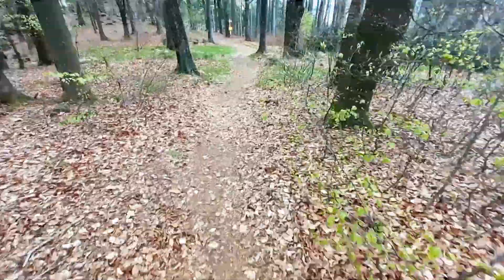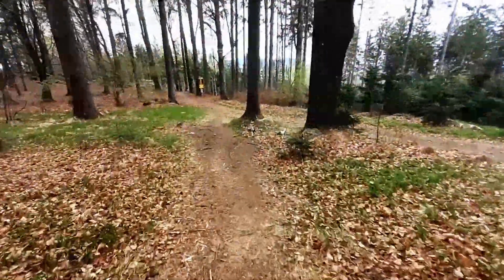So hi, Microbe Hunter here. I'm hiking a little bit today in the forest and of course it's also a good place to look for some samples for microscopy. It's early springtime, it's quite dry, so it's not going to be easy to find anything interesting, but actually I did find something, a little bit of moss.